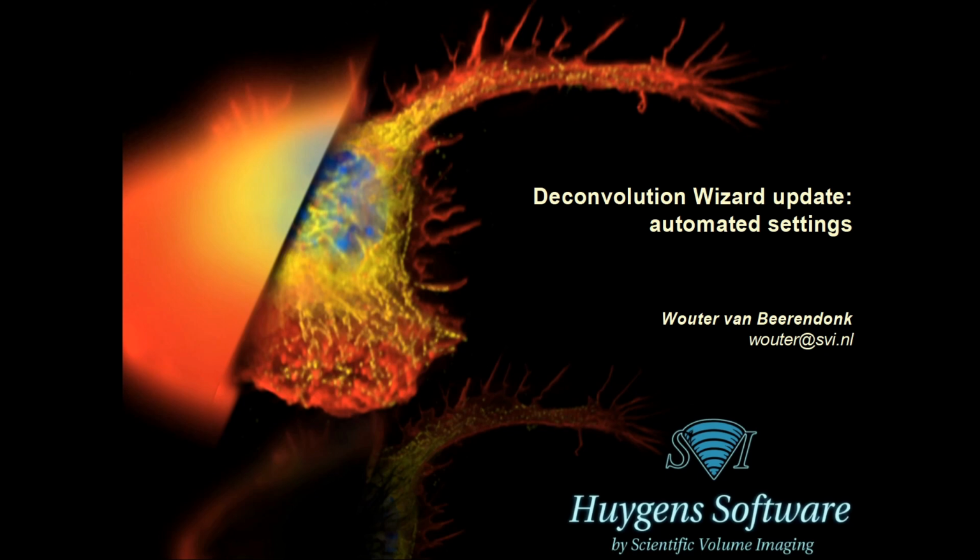The parameters can then, as usual, be stored in a deconvolution parameter template to use in the workflow processor to deconvolve in batch mode.